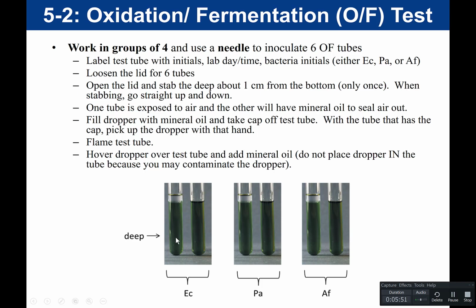So I would inoculate this one with E. coli. I would flame sterilize my needle, pick up more E. coli, and then stab inoculate this tube. So I would inoculate 2 tubes per organism.